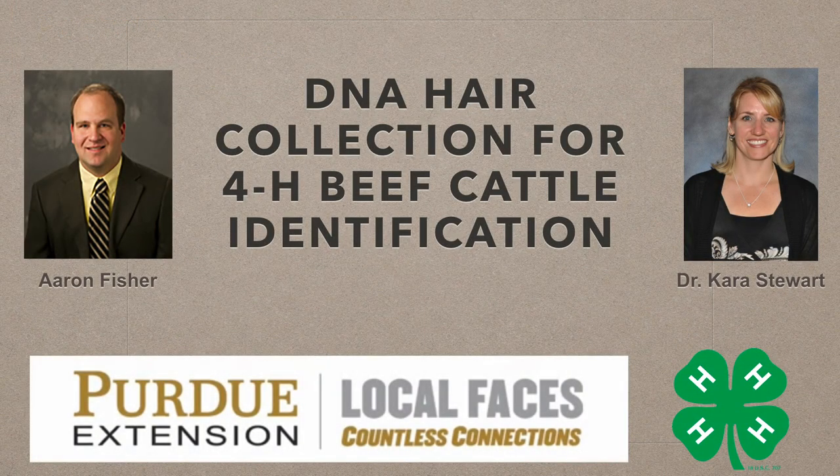I'm Dr. Kara Stewart from Purdue University. The purpose of this video is to demonstrate how to properly collect the hair sample from your 4-H beef cattle project.